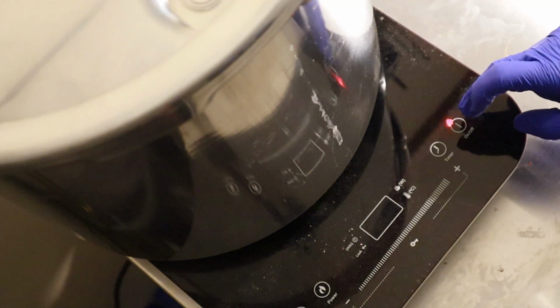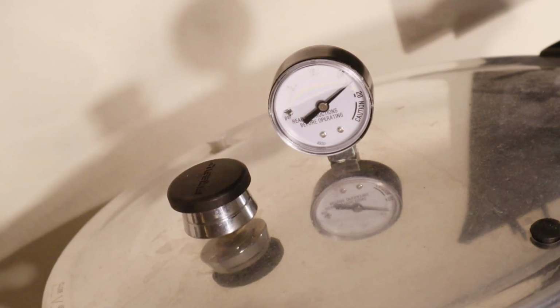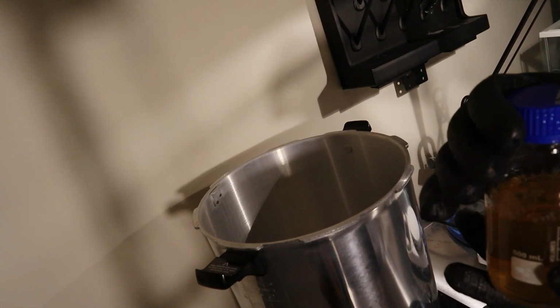Then I turned on the induction cooker. Once the autoclave reached 15 psi, I started a timer for 15 minutes. Once the 15 minutes were up, I lightly lifted the pressure regulator to release the steam faster. I don't recommend doing this as it can cause many things that you don't want. Once the PSI was 0 and the pressure indicator dropped, I then removed the lid with heat-resistant gloves. I then tightened the bottle of molten agar and removed it from the autoclave.